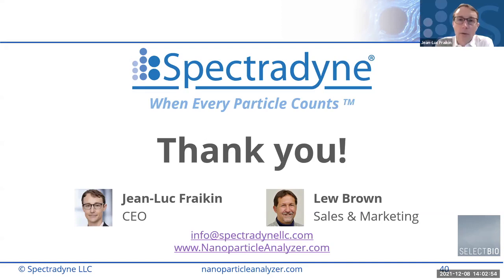Good question. If you go to our website, we have a cartridge map that shows the different cartridge sizes that we have available, the size ranges that they measure, and the concentration ranges that they measure. I'd encourage you to go check that out. Typically, what people end up doing is settling on one particular size that gives them the regular information they need about their sample. Once in a while, they'll do a very broad range measurement, but typically in day-to-day use, they're focusing on one size or another.